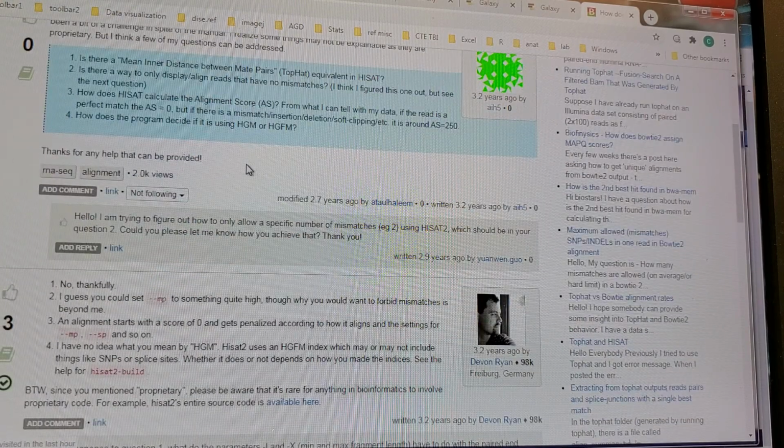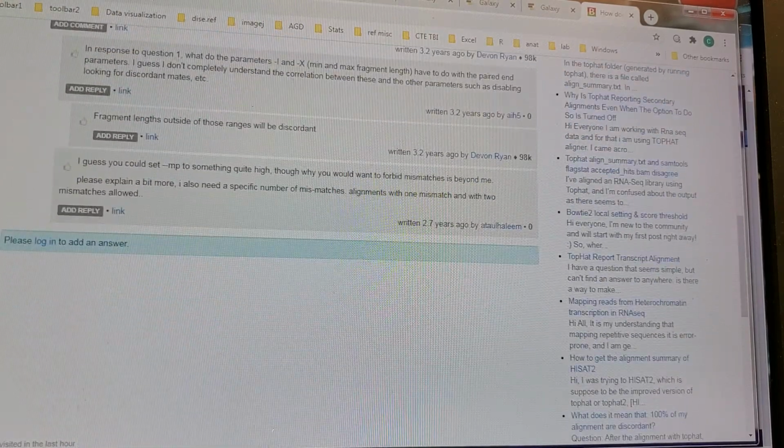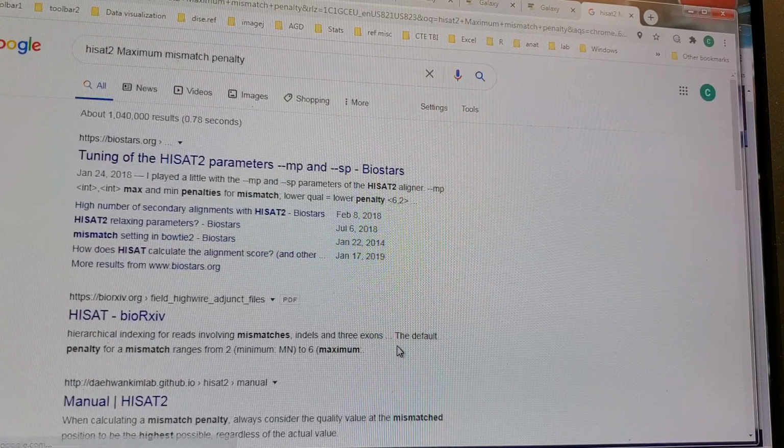They'll probably have the same questions that you have, and you can get a better idea of what the tool is and whether it's important, but you still want to test it yourself. Also, when using these, check the dates. Some of them are from 2014. The principles might still be relevant, but the software, and this is Bowtie 2, so it's not even HISAT, may have changed drastically in the intervening years.